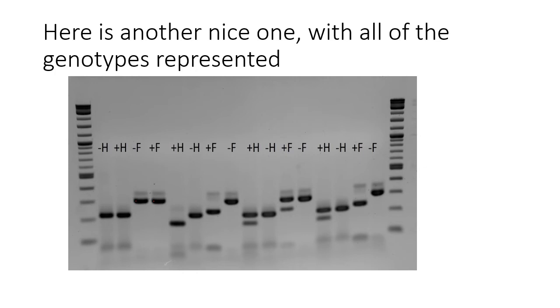Now, ideally, you'd have exactly half of your molecules cutting, and this is obviously a little bit less than half, but the existence of a significant amount of uncut as well as a significant amount of cut implies that the person is big T, little t. So one of their alleles for mom or dad does not cut, it's little t, and the other allele does cut.